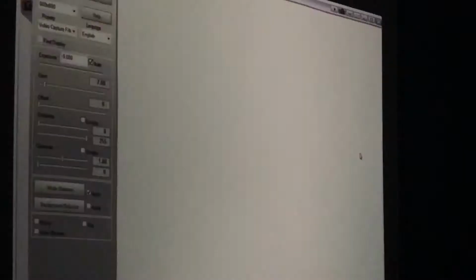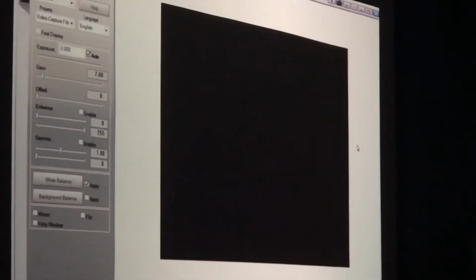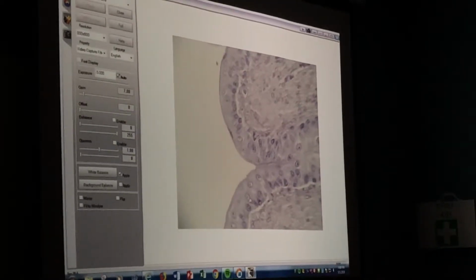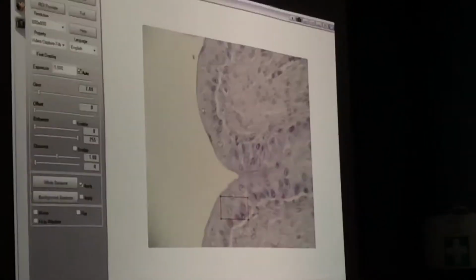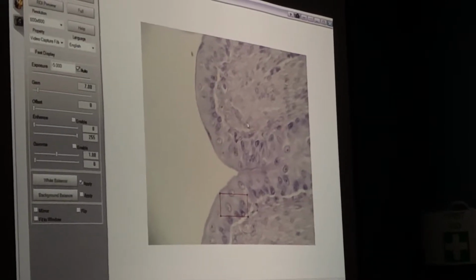So again, if we look right next to the lumen, what kind of tissue should we find? Next to the lumen, if I look at the epithelium here, this is going to be transitional. This one doesn't look nearly as thick as it did on the ureter. It's only like this thick, but still multiple layers, and the ones right next to the lumen are kind of roundish or balloon shaped, okay?